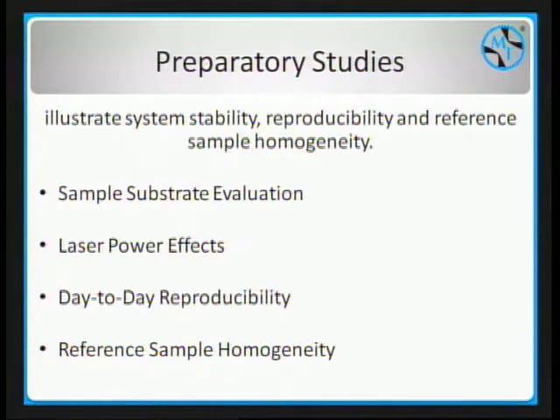On samples, how do you choose a laser power? And what effects does changing laser power have on the sample? The biggest effect we noticed, first of all, the laser power effects were minimal. We did notice a little bit of peak shift and broadening with increased laser power, and that was really due to heating, and it was reversible. But it didn't really change your ability to qualitatively identify pigments, so it's not really important.